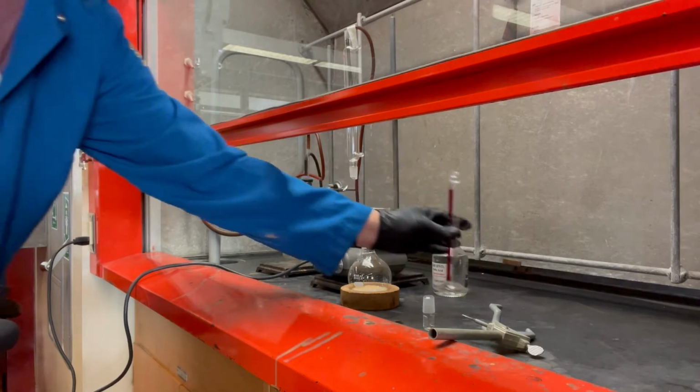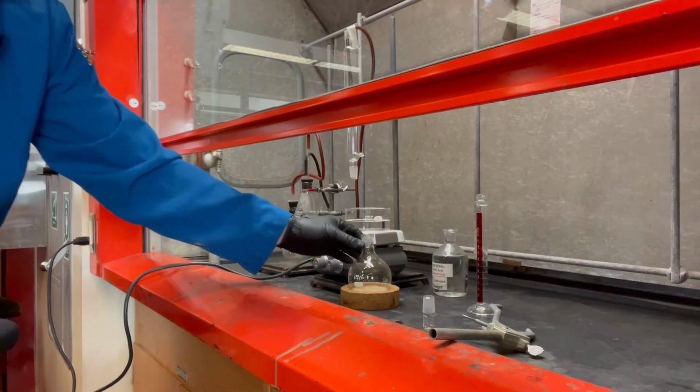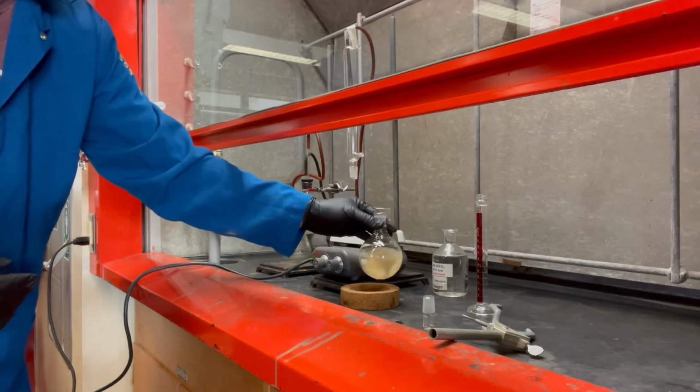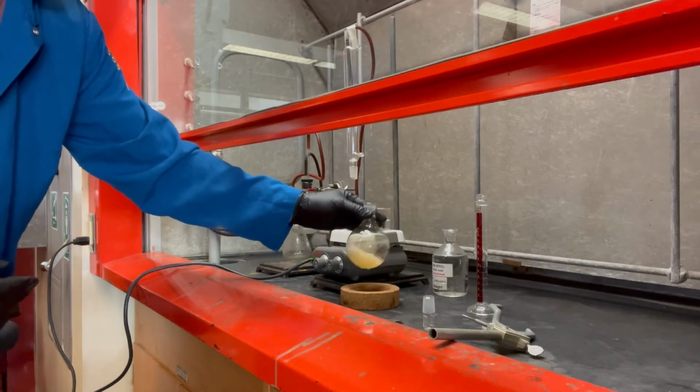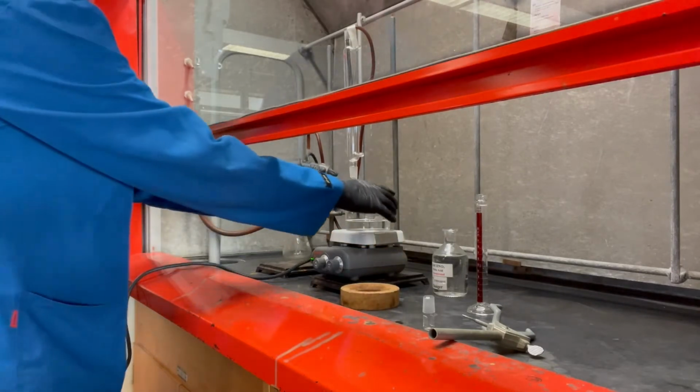All right, good. It didn't get crazy. Just in case, if you got any nitric acid on your gloves, you want to change those immediately. It'll eat straight through those.